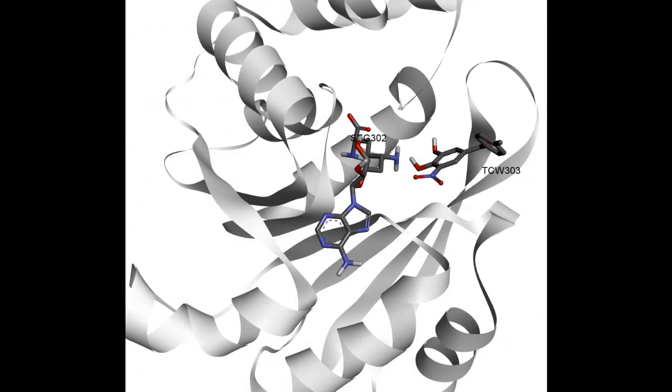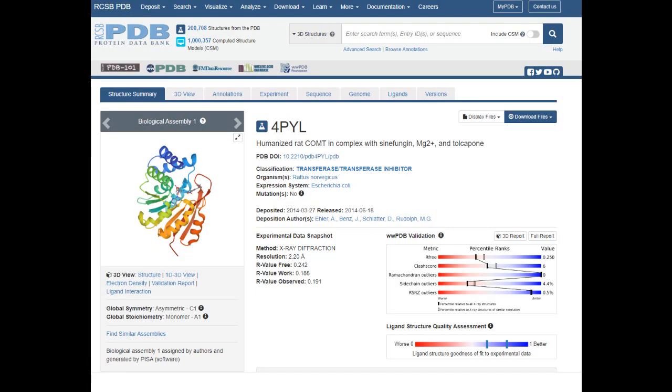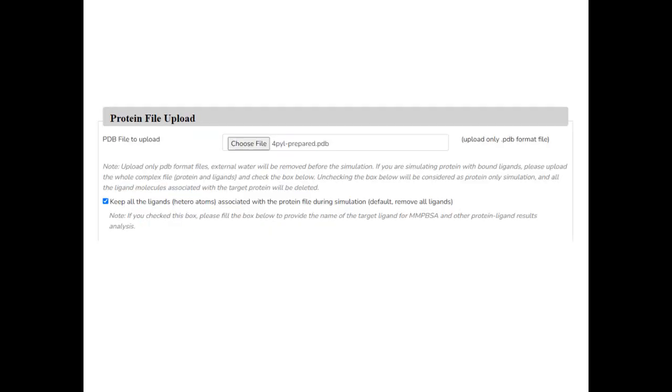In this example, we will upload catechol-O-methyltransferase bound to two ligands, namely sinefungin and tolcapone, retrieved from PDB databank 4PYL.